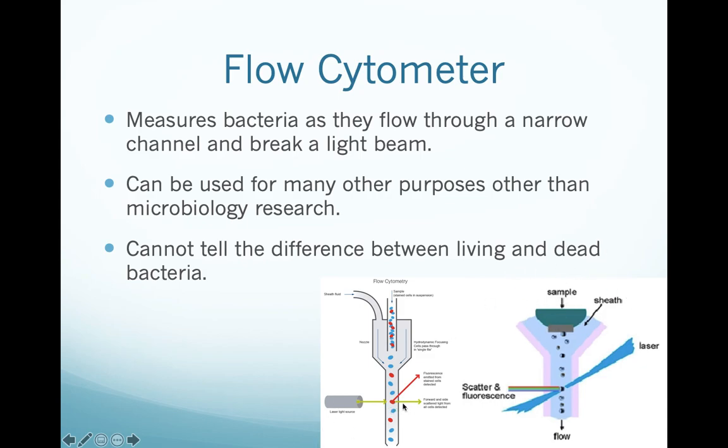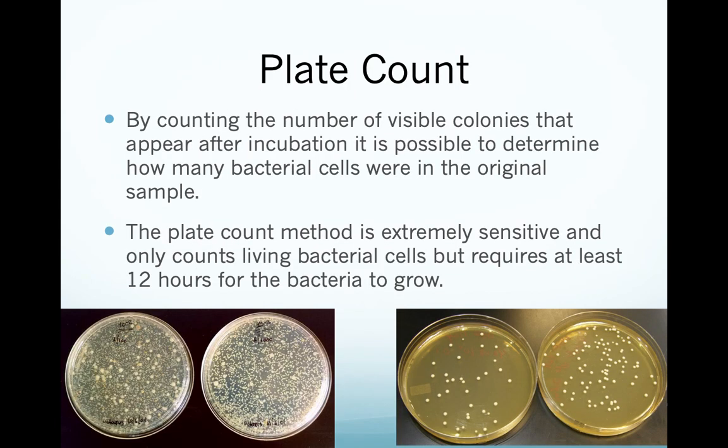Dead things and living things both break the laser beam. Anything that's physical will break the laser beam. So once again, you don't get just the living cells that are present in your sample. You get both. You get a plate count.